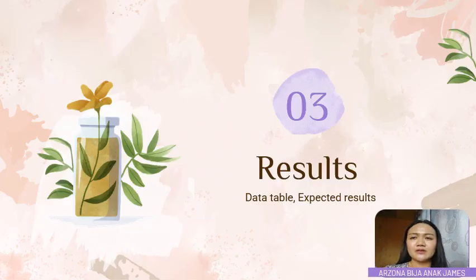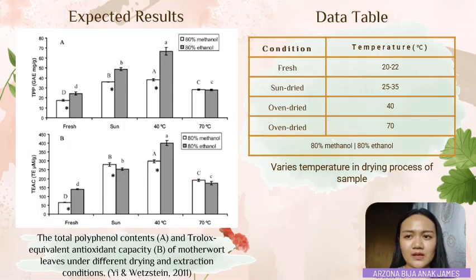I will present about the expected result of this experiment. So the calculated data is the TPP, which is the total polyphenol content, and TEAC, the Trolox equivalent antioxidant capacity of motherwort leaf. The temperature difference is during the drying process of the samples.